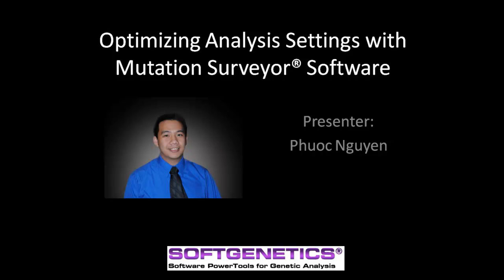This webinar will focus mainly on the process settings used to run the analysis and how they can be used to analyze certain sequences as well as solve some issues. For all that are concerned, please refer to the specific webinar.